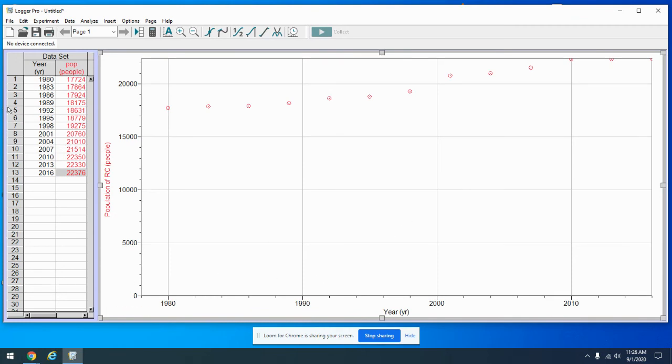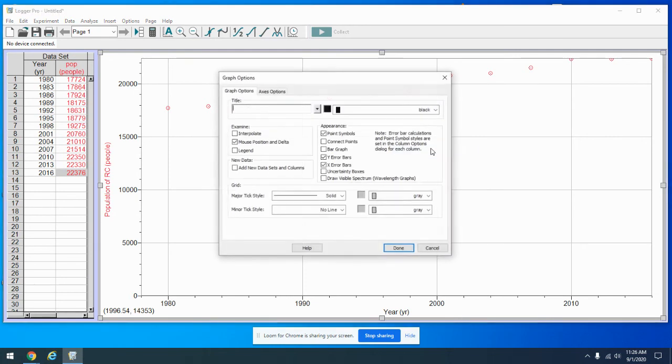And one more thing I want to show you here is to go to graph options. I right-clicked again, or on a Mac, you're going to option click to get that. In this graph options here, I can give the graph a title, and the title of a graph is always going to be whatever is on this axis versus whatever is on this axis.